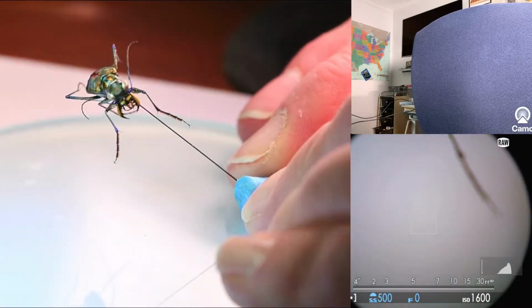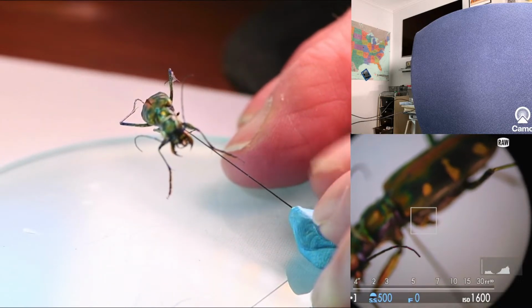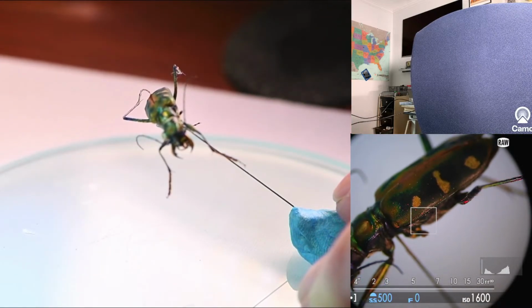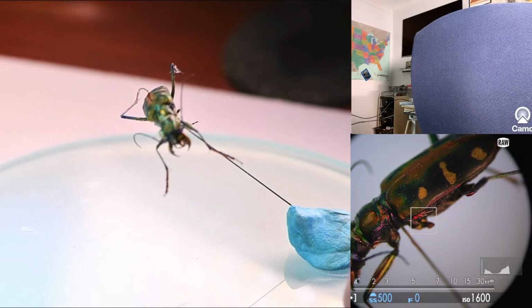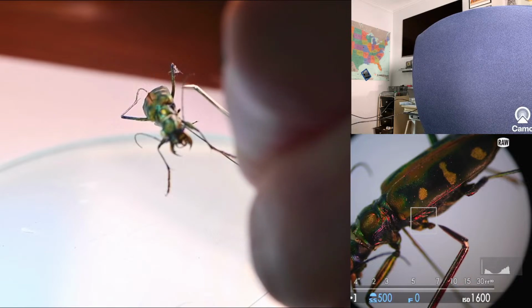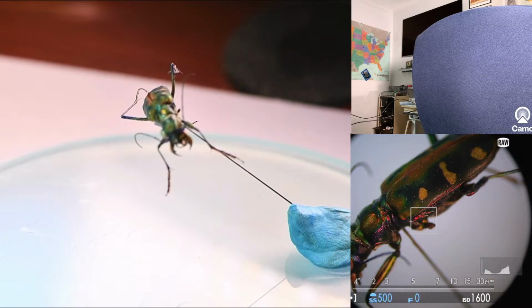This appendage, the second appendage, is broken off, and it's a little hard to see whether or not it's left a stump. I think that probably you can see now that yes, it has. It's left a stump. So it's actually broken off at the first joint, not with the abdomen itself, but after the first joint. So there's a little piece of appendage, and then the rest of it's missing.